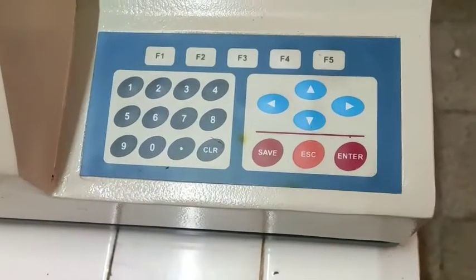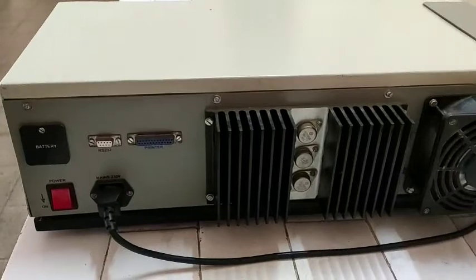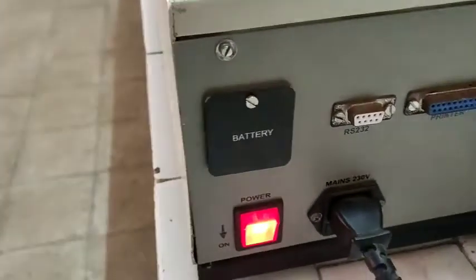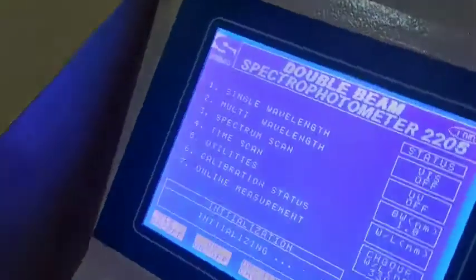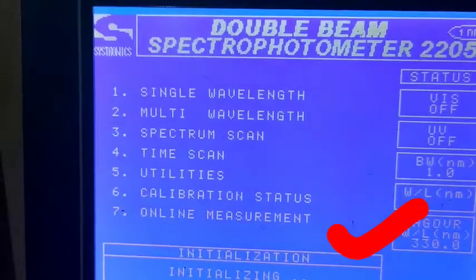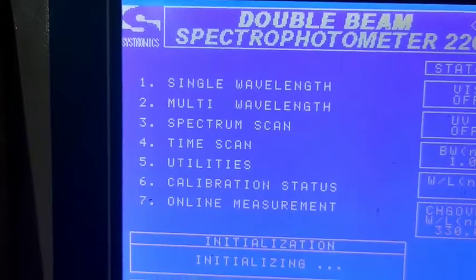From the back side of the spectrophotometer you can see the keyboard — it has F1, F2, F3, F4, F5. This is the display and it is not showing anything right now. From the back side there is a power plug and a power button. As you switch on the power button, you will see the display showing: first, single wavelength; second, multi wavelength; third, spectrum scan; fourth, time scan; fifth, utilities; sixth, calibration status; and seventh, online.